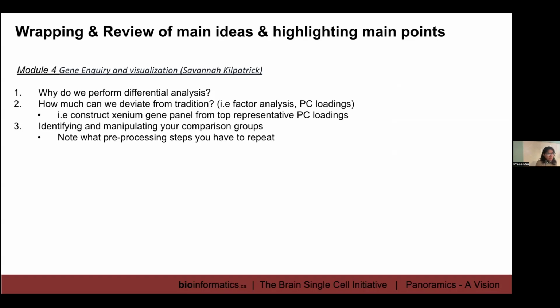So you can just look at a PCA plot. You can look at the top and bottom PC loadings, and you can investigate whether there's any sort of gene enrichment in any of these cell types. And someone asked the question if you can subcluster, all right? And you can just look at the subcluster groups and you can do a differential analysis.